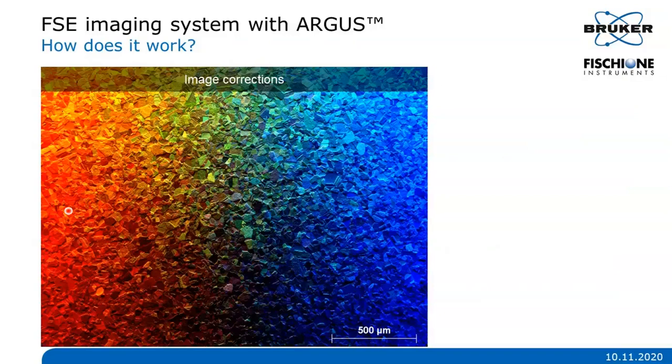This one looks a bit funny. It's an example on stainless steel again. Here the area is scanned using the 3 FSE diodes only. The top of the image shows high contrast because it corresponds to the bottom of the sample, which is closer to the FSE diodes, as opposed to the lower part of the image, which is closer to the pole piece, further away from the FSE diodes. So why do we have this distribution of color?